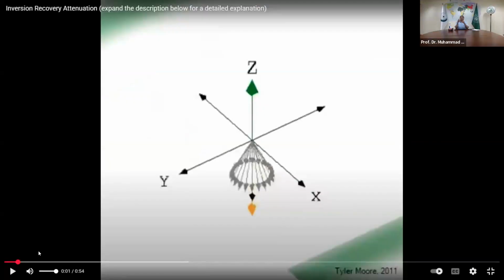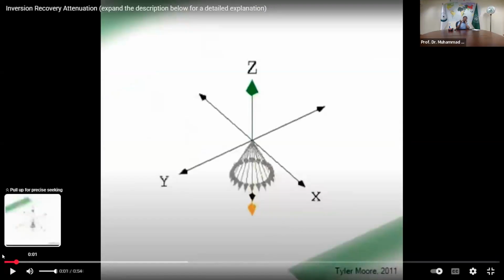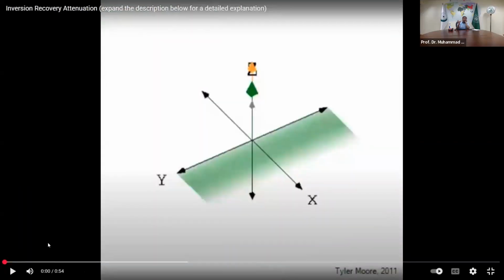So can you see? Okay, so you see the 180 xy pulse brought this magnetization vector down there. And remember that the bulk magnetization vector is just a representation of several vectors of the same direction. Then a 180 pulse brings it from z to minus z.